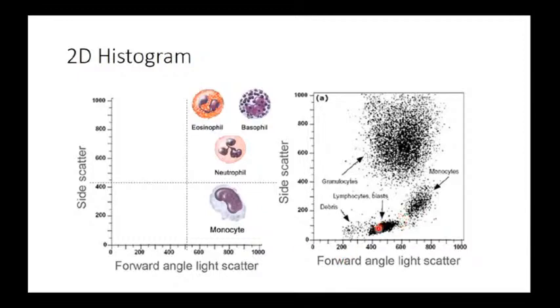Here we have very simple cells because they give very low signal on the side scatter, and they are smaller than monocytes and granulocytes. So obviously these are lymphocytes, because the lymphocytes are smaller in size and they are simple cells. Of course, this is a very useful technique used to count the cells and to analyze the phenotype and the health situation of the cells.